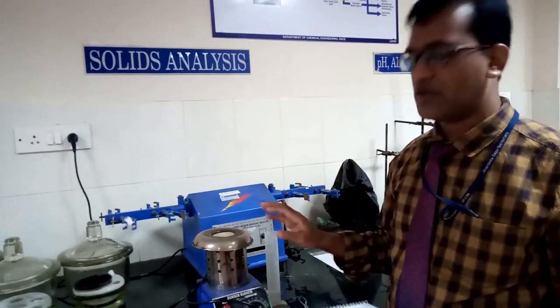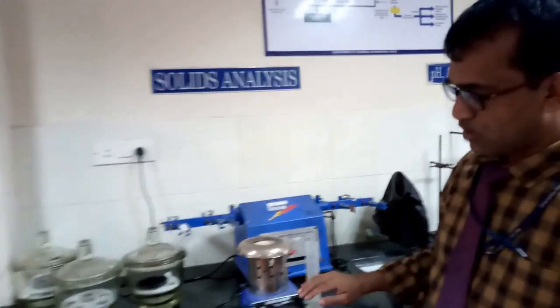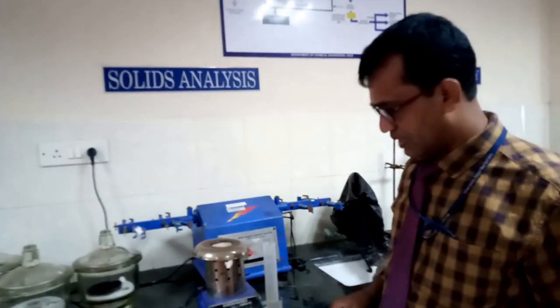the muffle furnace to 550 degrees centigrade. Once it reaches 550 degrees centigrade, switch on the lights and fix the temperature, so it automatically starts heating and the temperature rises.